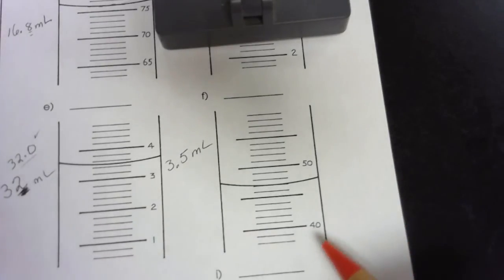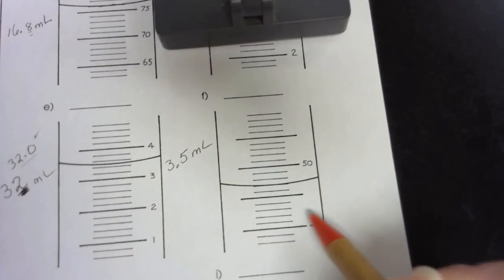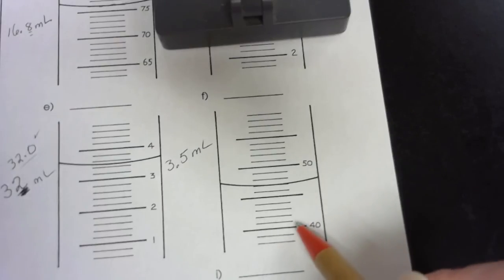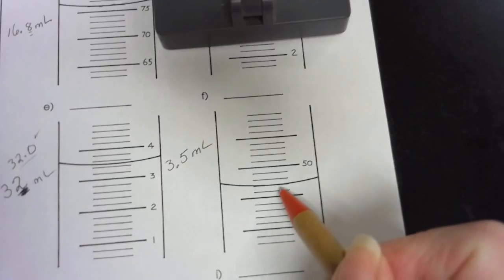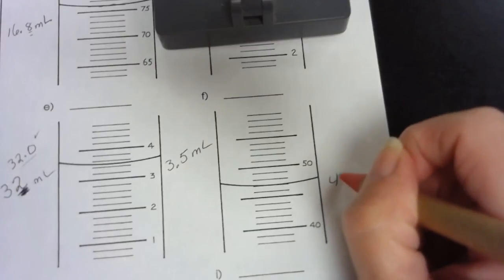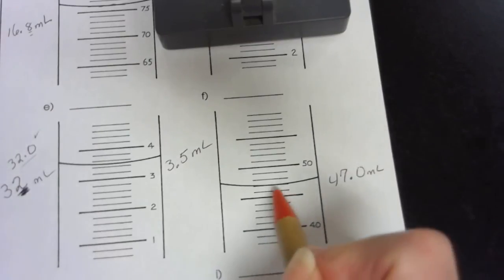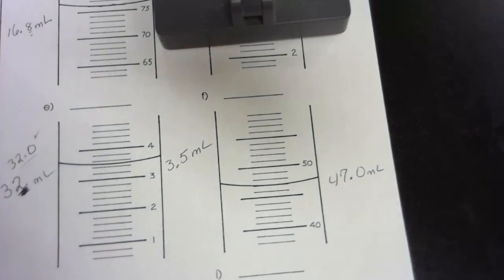Okay, so here we've got 40, and these are in increments of 1, 45, 46, 47, and I'm going to estimate that last because it looks like it's right on the line there.